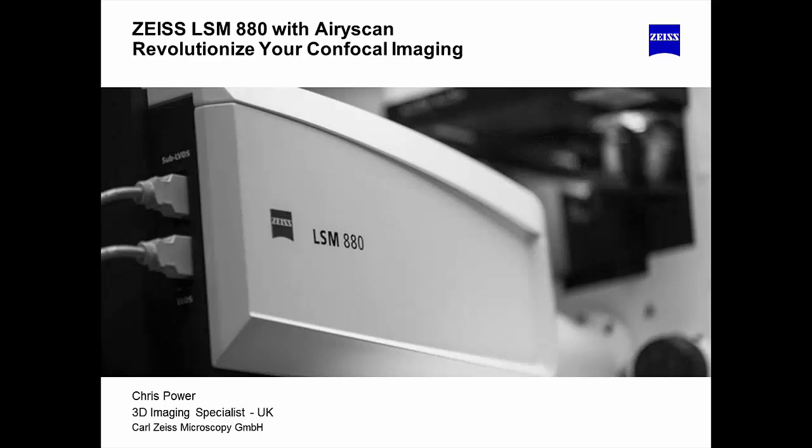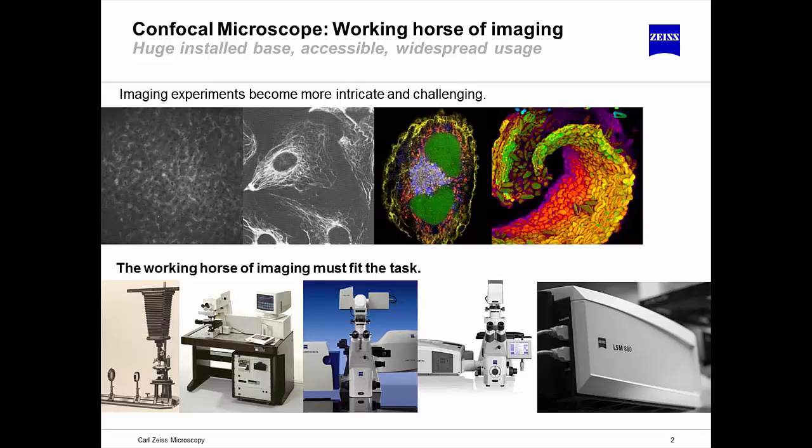Good afternoon, everybody. This afternoon it's my great pleasure to run through the new LSM 880 and to also cover the Airyscan. Confocal microscopy has evolved over the past 30 years from the basic LSM 10 in the early days through many generations of system. This workhorse of biological imaging has really evolved to meet the challenges of the applications. We tried to keep the system moving on to match the needs at the time.